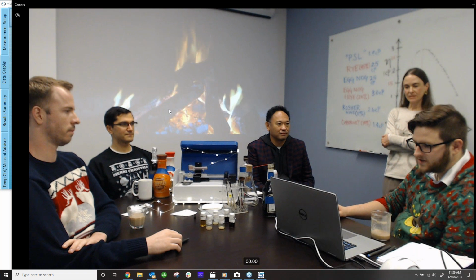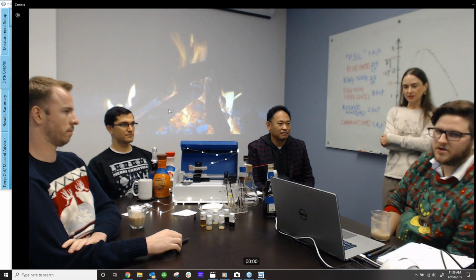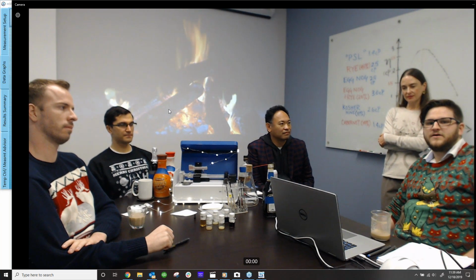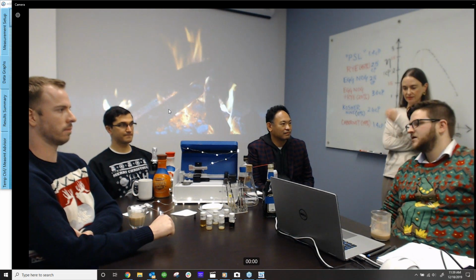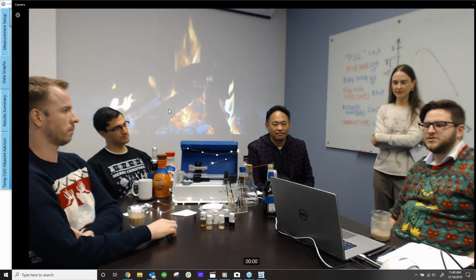Another question we got, will chem wipes work with your system? We always recommend not to use chem wipes. We find that although they say they're low in fibers, we've had multiple customers that have fibers because they use chem wipes. We always recommend lint-free wipes, and then also air drying off anything that's going to be touching any of the sensors or sample or anything like that.